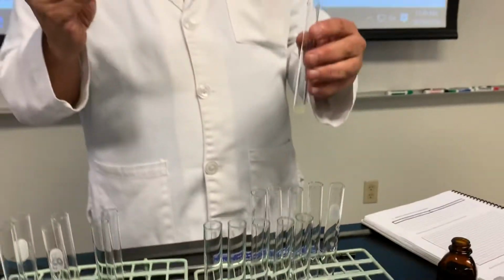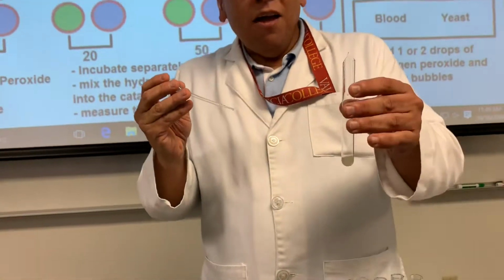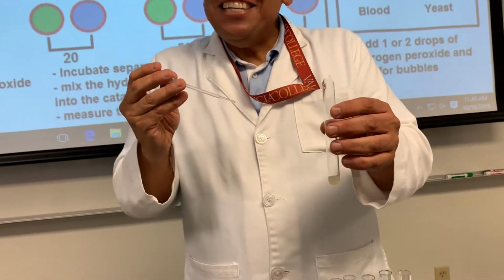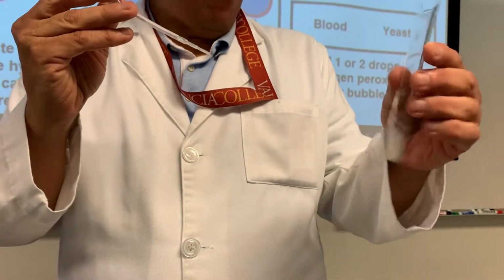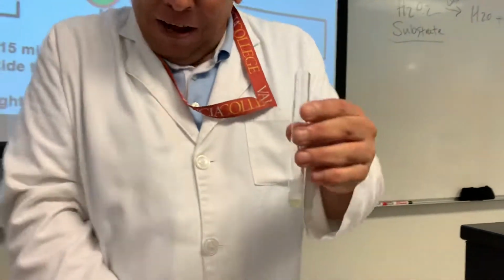Now, I want you to do something. Promise me. As soon as you see the bubbles, I want you to say, wow. Okay? Because that's as exciting as it's going to get. All right? Nobody? No wow? There you go. Thank you. I thought you would get excited there.